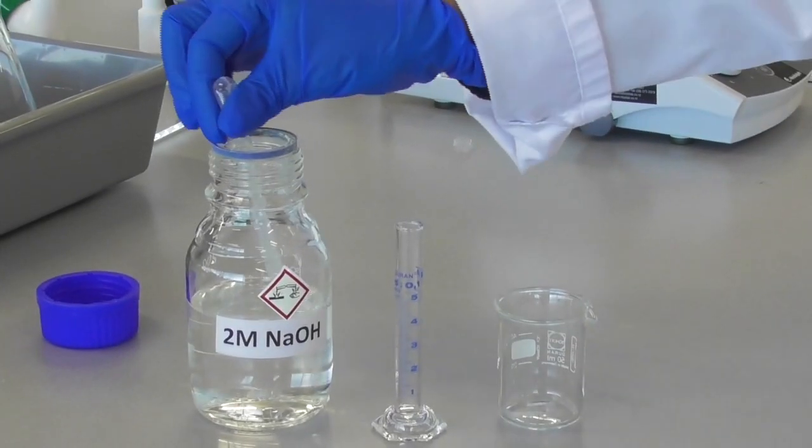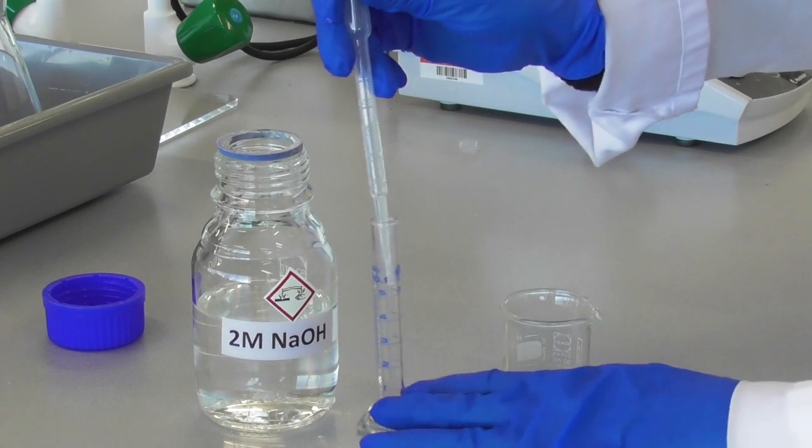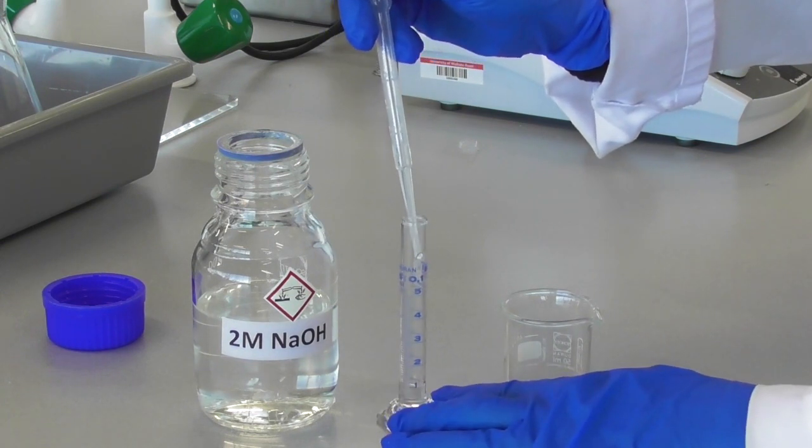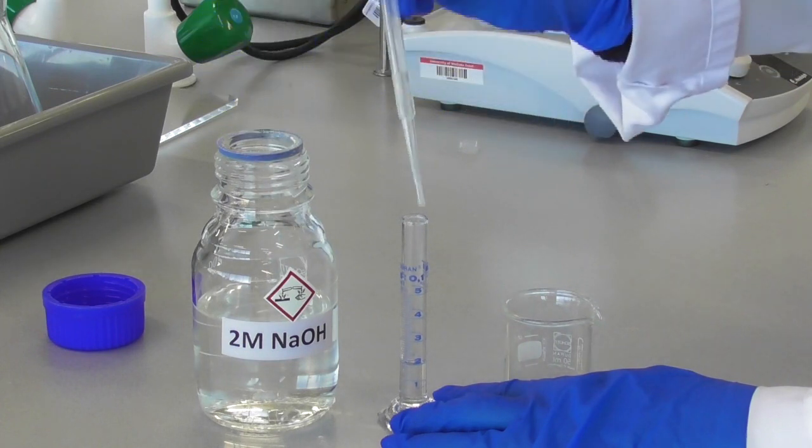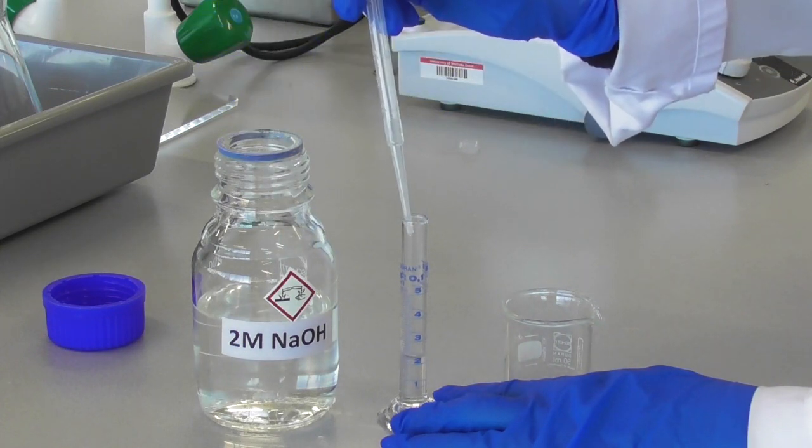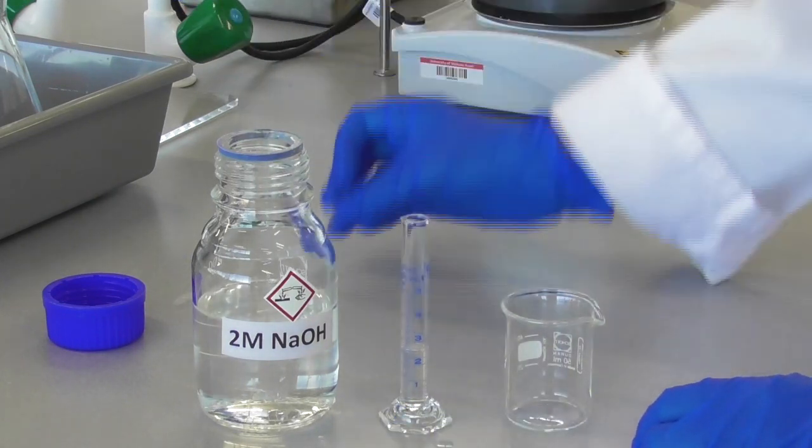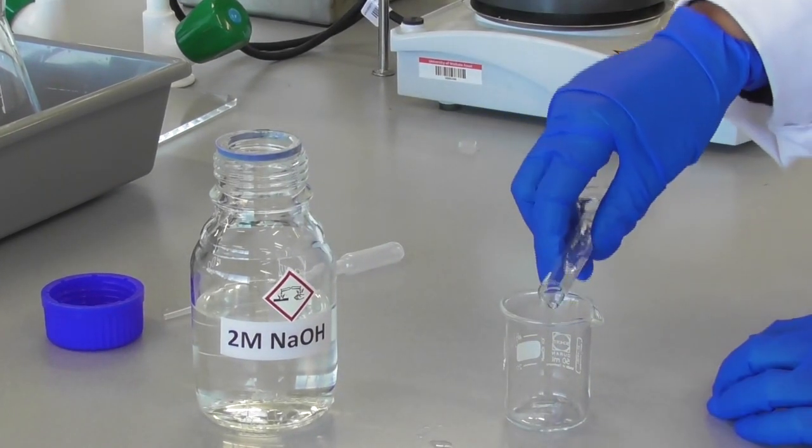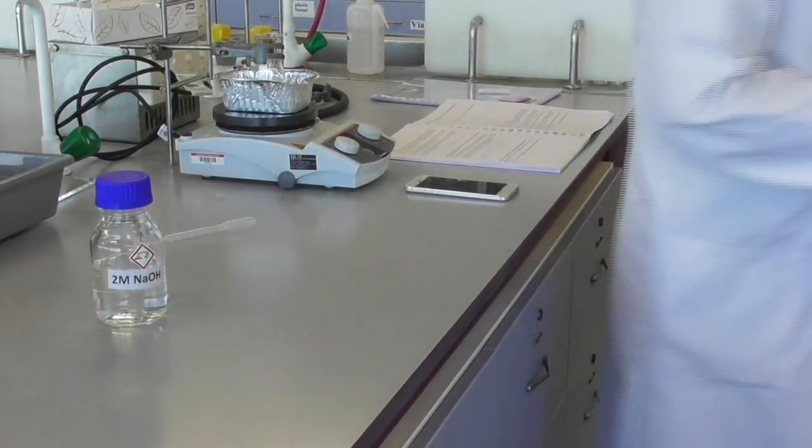I prepare a solution with a second reagent by measuring out 2.5 ml of 2 molar sodium hydroxide solution. I pour the sodium hydroxide solution into a small beaker and take this beaker to the fume hood.